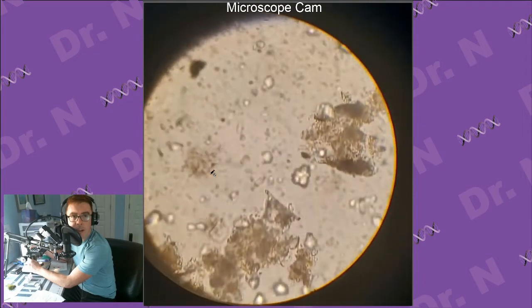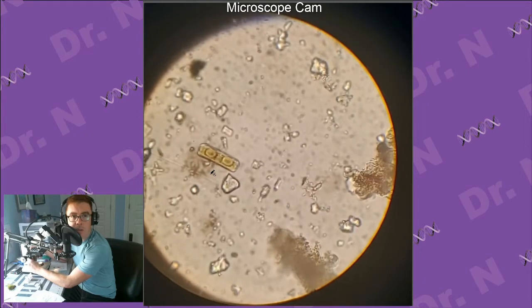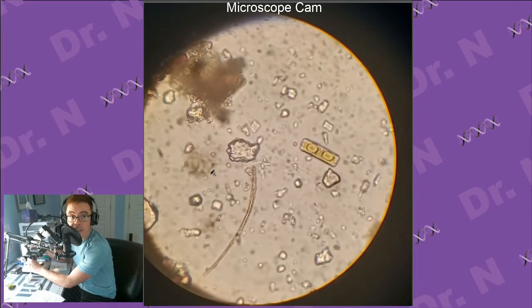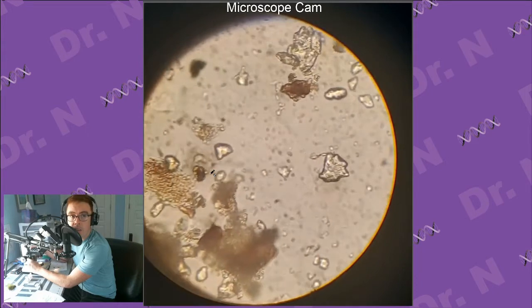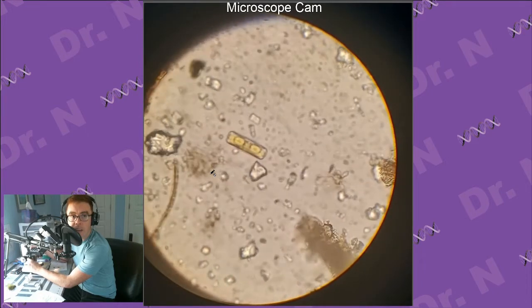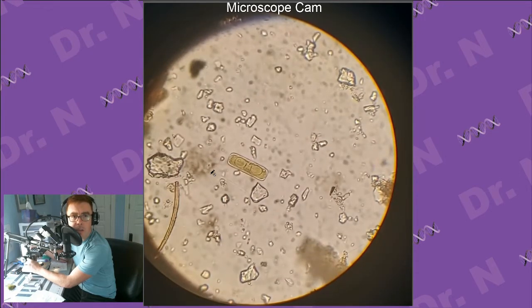Let's move on. Anyways, given the time, I might just do one last thing, which is swab my cheek for cells. Those are really easy to see. Those are nice and big. They will be dead. But you can really see the nuclei on those.